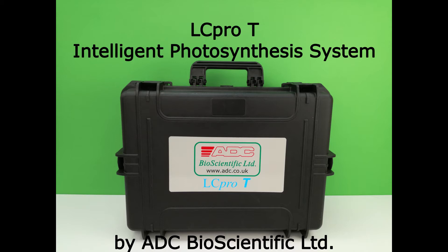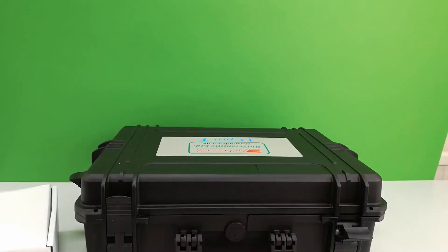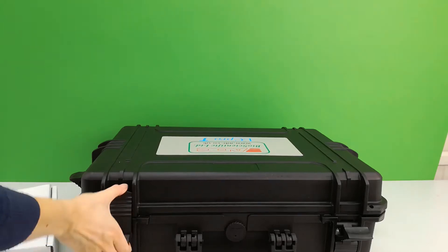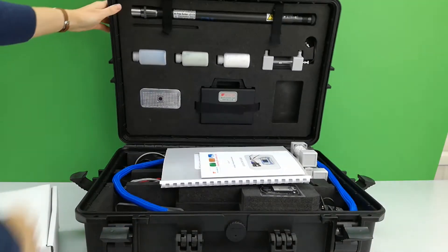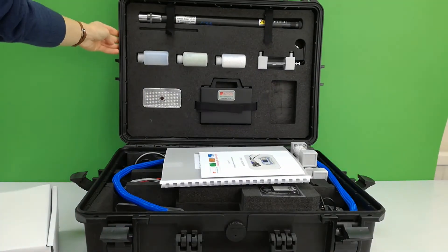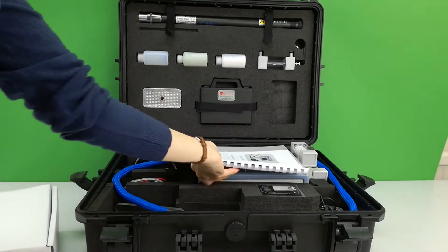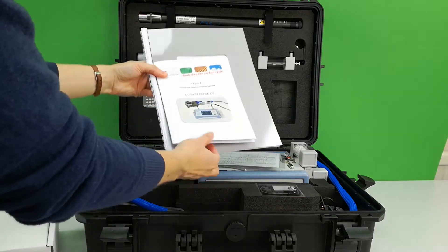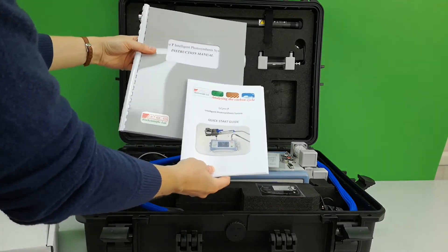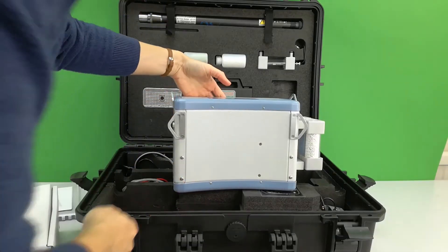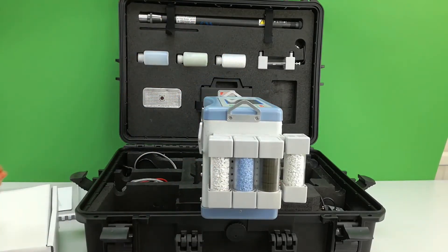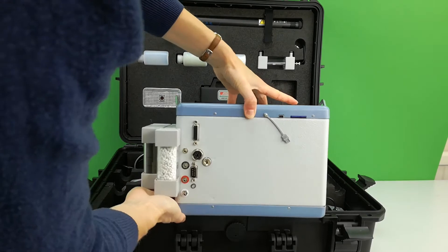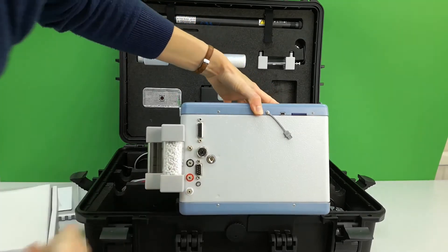Welcome to the LC-PRO-T by ADC Bioscientific. The LC-PRO-T performs measurements and calculations of photosynthesis and transpiration whilst automatically controlling the leaf chamber climate.